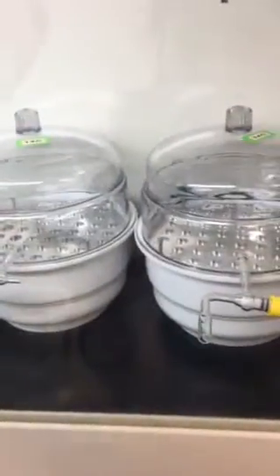And then we do 200 targets, then they go into here, and then we bring them downstairs to the accelerator. So we'll do a separate video for the accelerator.